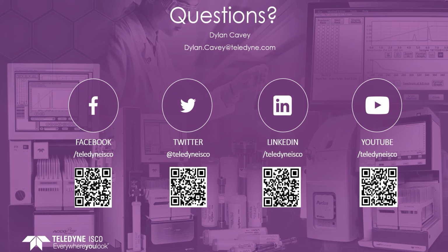Some other questions: are there any suggestions for use of non-UV compounds? That's one of the problems with TLC: you're not going to be able to calculate that retention factor if you can't see where your compound was. Luckily, the CombiFlash NextGen units can come equipped with an ELSD. So your compound will elute and you will be able to detect that. And then you can use the Focus Gradient Generator to, again, generate that gradient and achieve good separations.